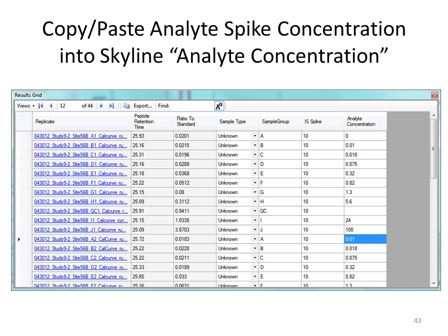The QC, just leave it blank. That's not relevant for the curve right now.